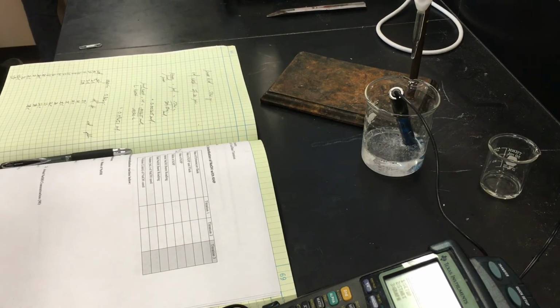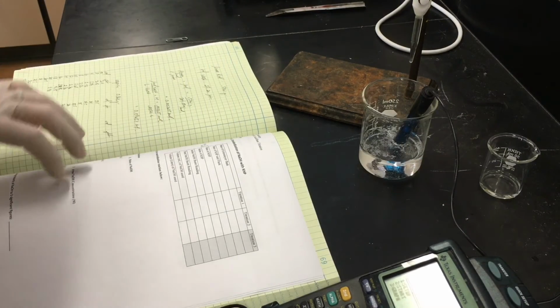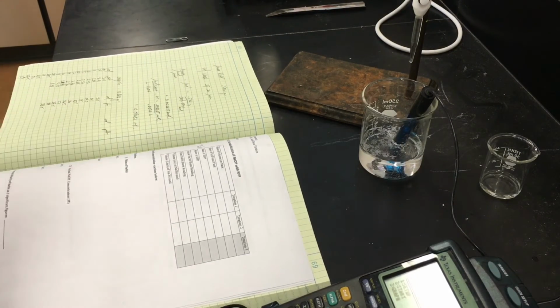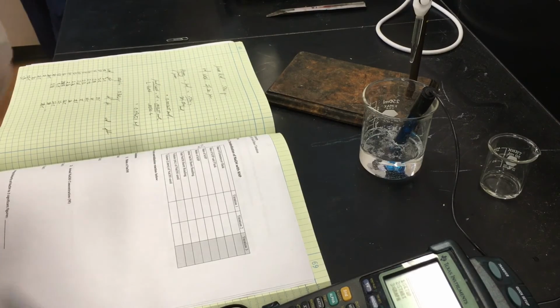2.29, and we're going to continue like this until the first 20 milliliters are added. So after 20 milliliters added, our pH is at 3.4. We're going to continue now adding 0.5 milliliters at a time.